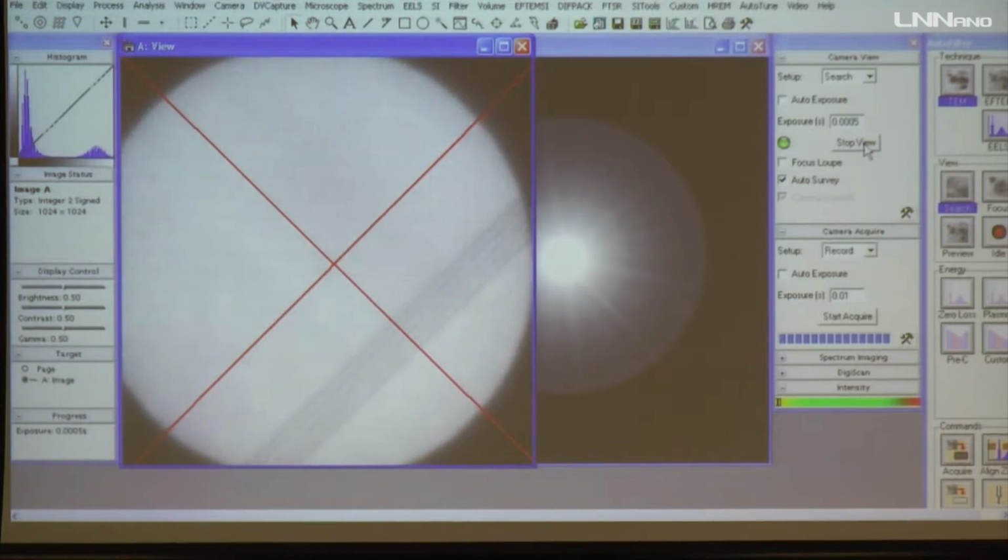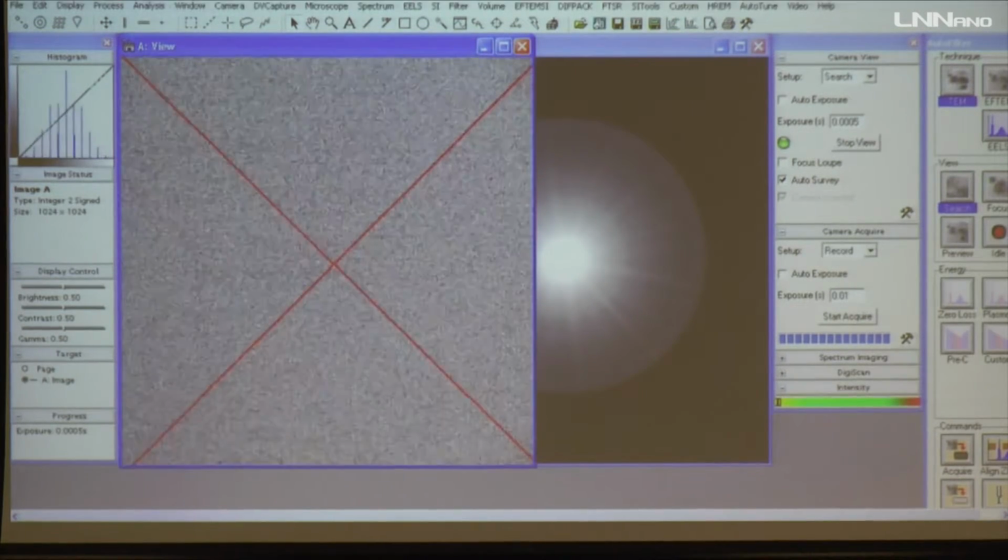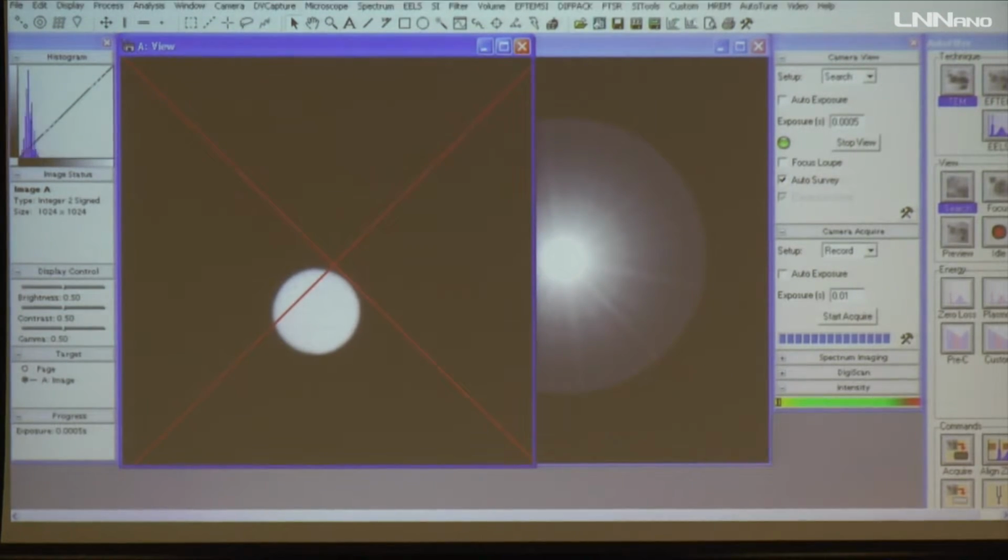And that's good. So there, this is a selected area diffraction. So I need to use the selected area aperture. Put the aperture in. Maybe I will be using the third largest aperture. So that's okay. I move it to the optic axis.